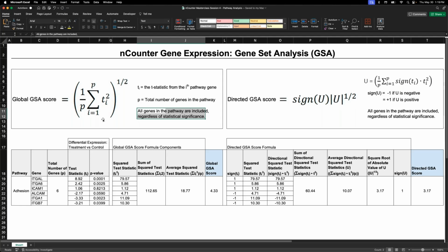So let's imagine a hypothetical scenario where we are looking at, let's say, the adhesion pathway. Let's pretend there are these 6 genes in the adhesion pathway, and we want to perform a differential expression analysis between 2 groups of samples. Let's say we have some treatment samples and control samples. We want to find out which genes are significantly differentially expressed between treatment and control. So the output of that, as many of us know, is a p-value indicating whether the gene is significant. That p-value for our genes is shown here. Some of these genes are significant, less than 0.05. These 2 are not, and then these 2 genes are significant.